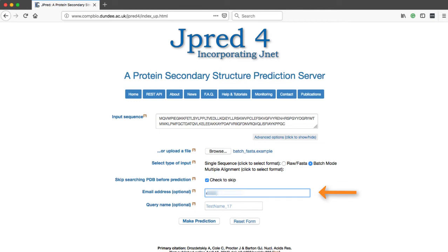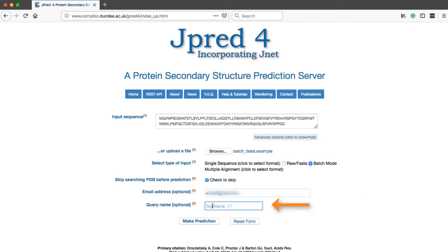An email is sent when the prediction is complete. It will contain a link to the results. A batch name is also required, as this is needed to identify the prediction. Query names should be alphanumeric characters.